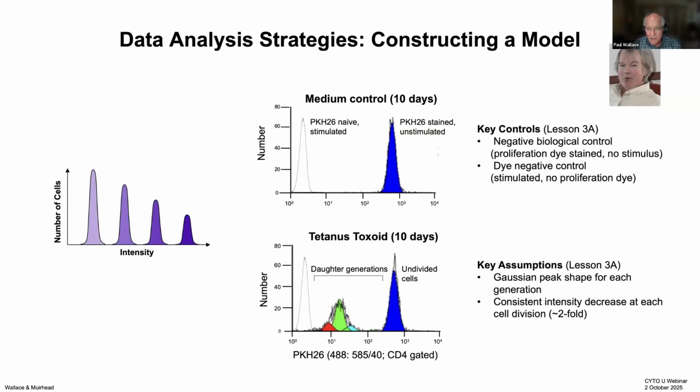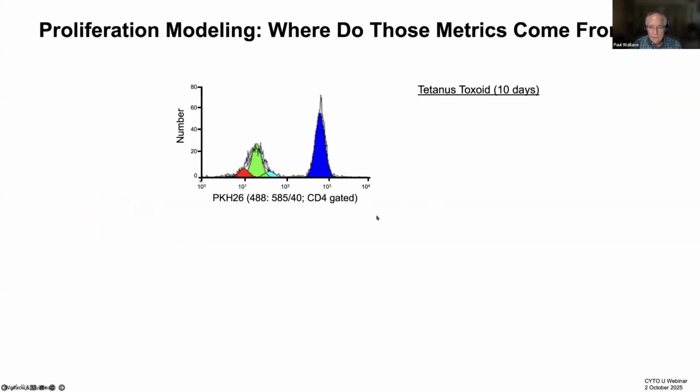Finally, curve fitting software is used to vary the exact position, height, and width of the Gaussians to sum the number of daughter cells from each generation, colored peaks here, in every channel, and to obtain the best match between the calculated histogram, the smooth black line, and the observed histogram, the unsmooth black line.